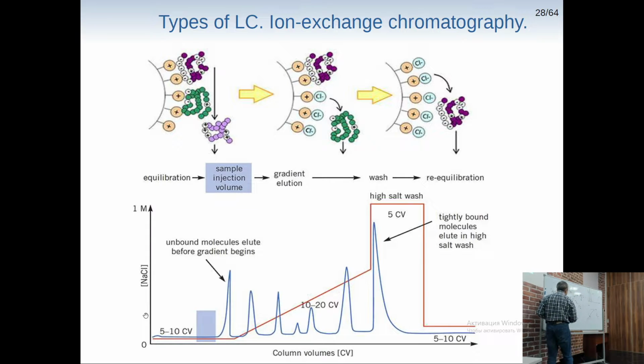This chloride will compete with our protein. Since chloride is smaller, it's easier for it to compete and then just repel our protein from here.